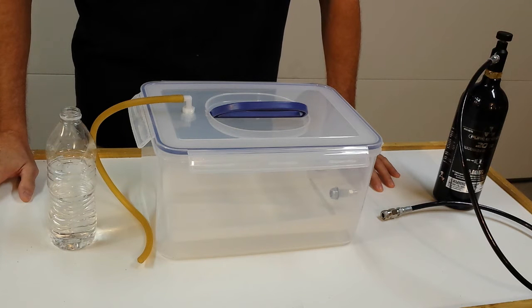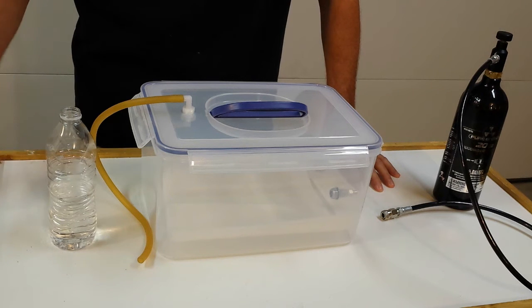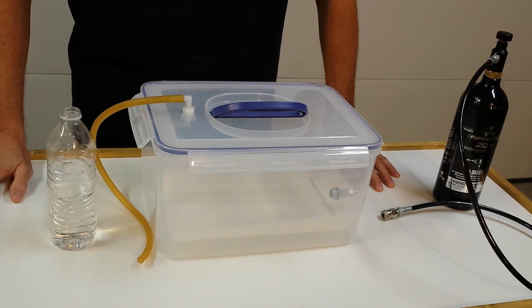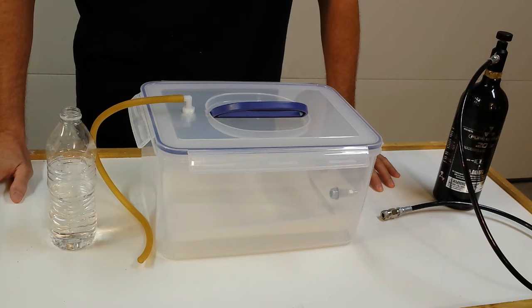I'm not going to do a live demonstration or anything like that, so if that's why you're here, you're not going to see it. But I am going to show you how it's done and I'm going to show you how to make the CO2 chamber itself.